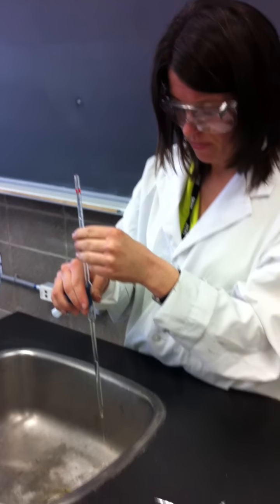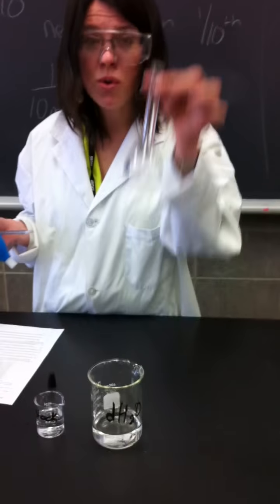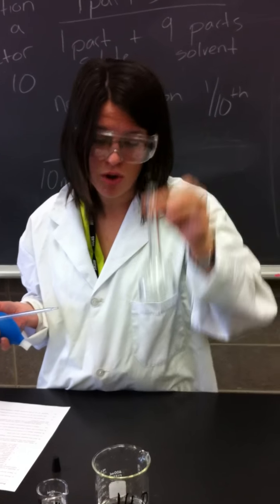And you're also going to do the same thing with your volumetric flask. Okay, so just imagine you're going to do that 2 more times. So there's a lot of rinsing and cleaning. You're also going to clean your volumetric flask with distilled water at least a couple times. Okay, so we've already done that for you.